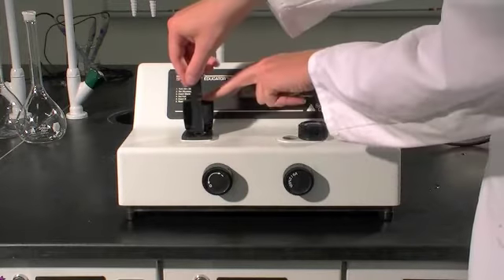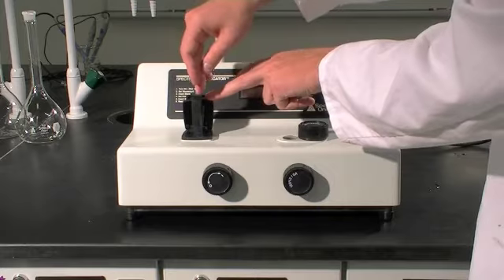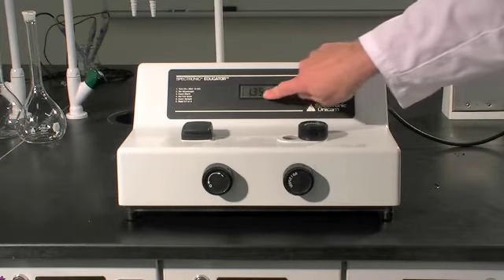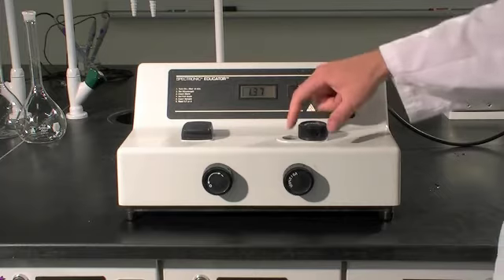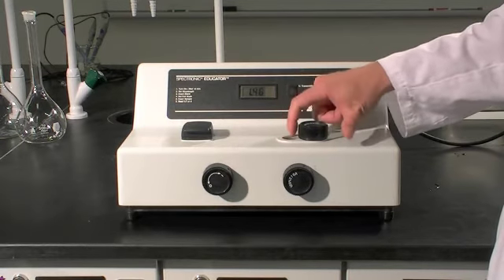Put your holder in here so that it's facing in this direction. Close the lid. Record the absorbance when it settles, as well as the wavelength, through the little screen right here.